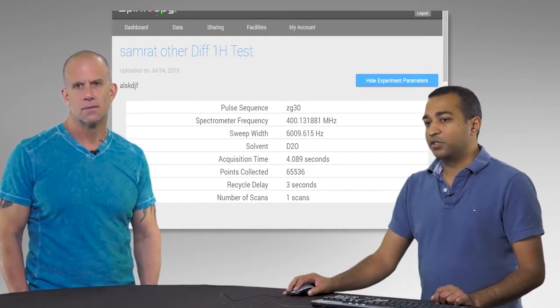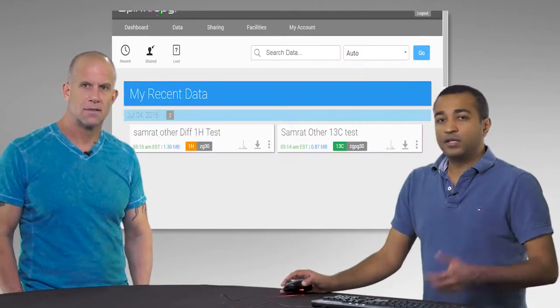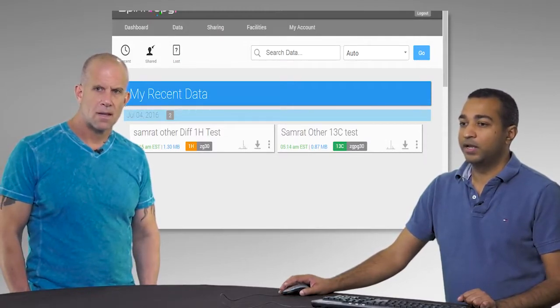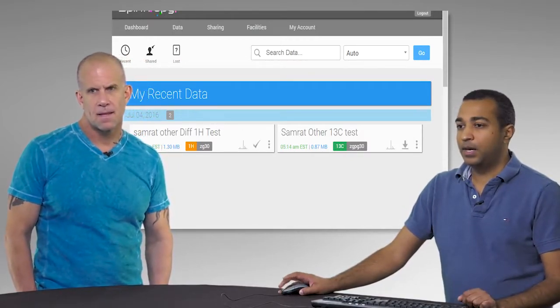Okay. The other thing you'll notice is whatever we put in that comment box will actually show up here as well. Oh, so your comments show up as well. Yeah, so that's another reason to put in whatever information you want. And what's the second button? Looks like a download? Yeah, this just downloads a file to your desktop.